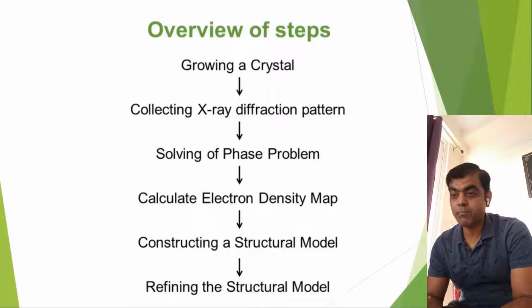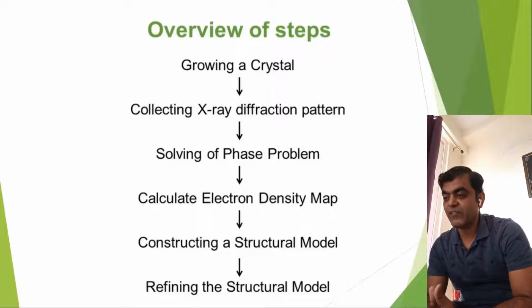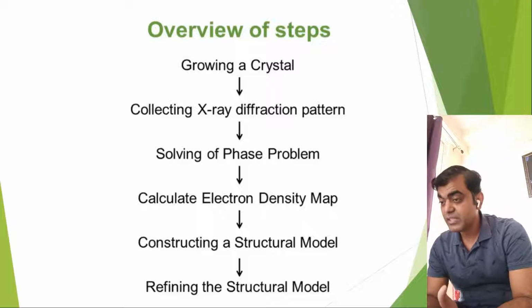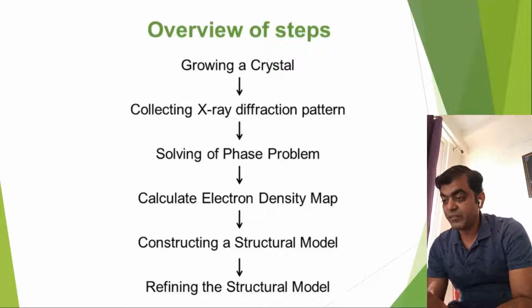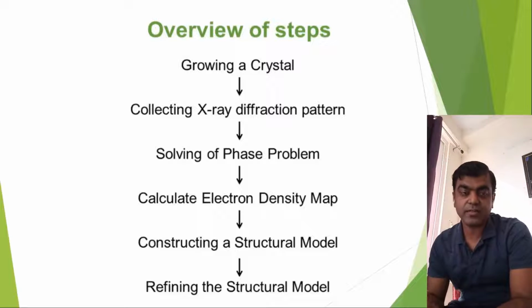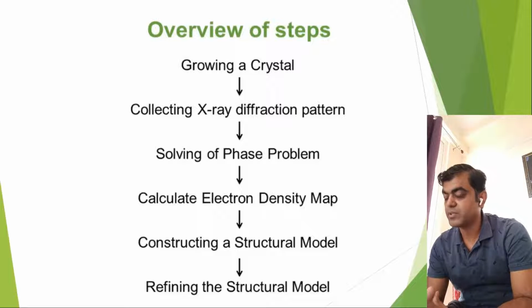But the important thing I had been telling is the phase, whether they are in the same phase or not in the same phase, right? So what is the problem with phase, and how can phase give us a much better idea about the structural details, that we are going to see.